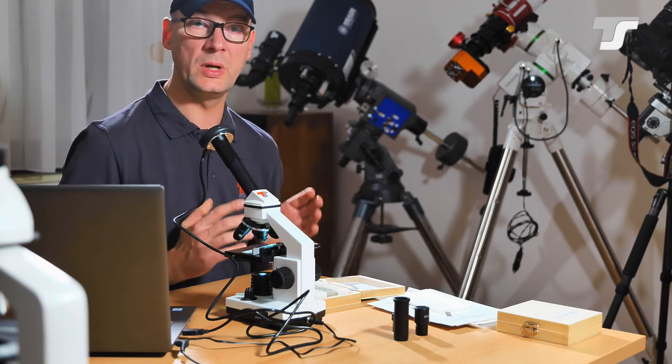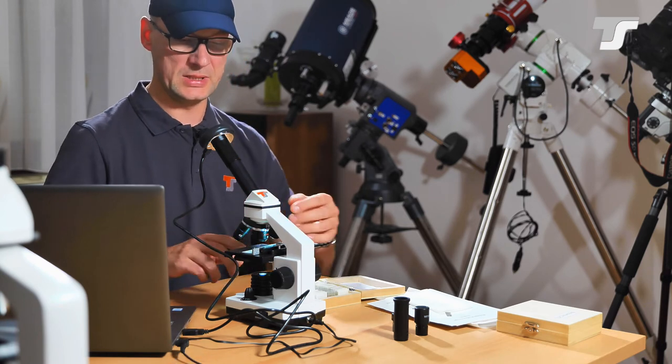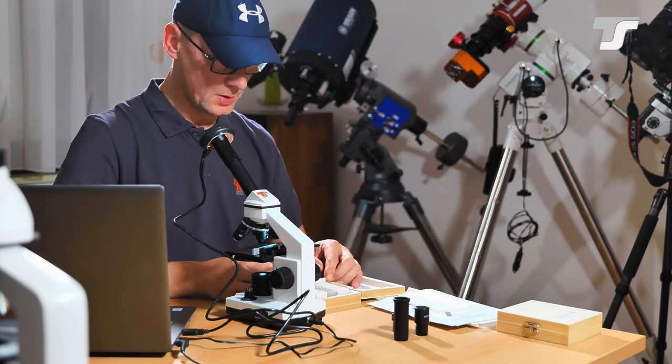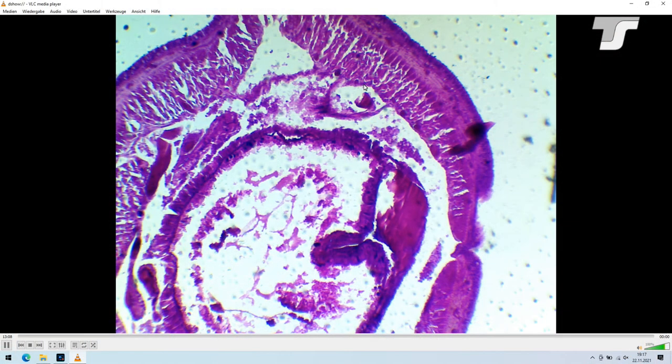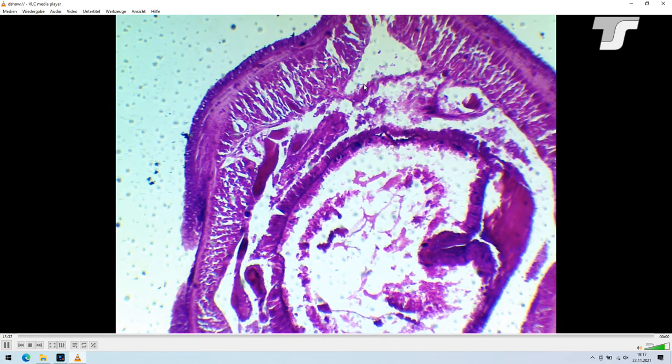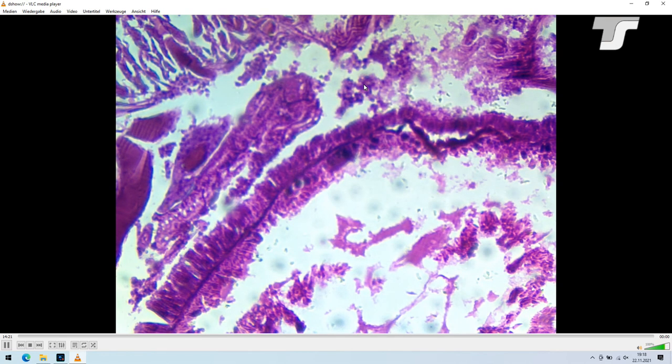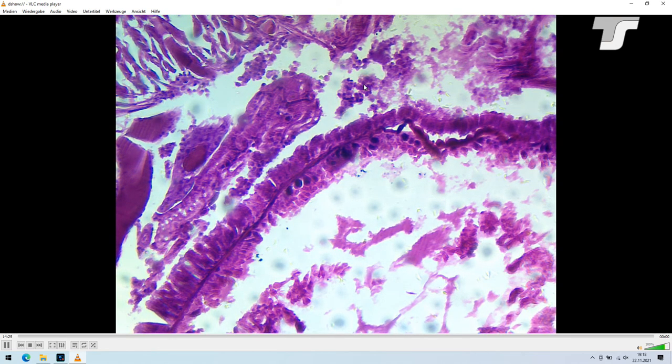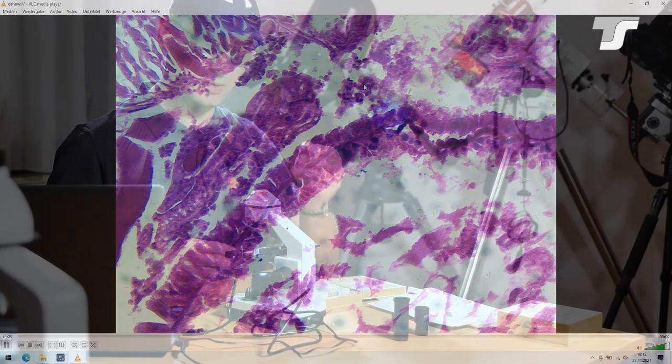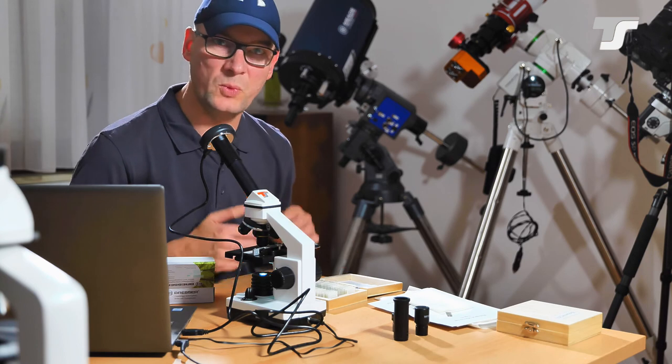And I think this is also a real cool gift for younger people, for students, for kids to get their first steps into biology for example. Okay let's grab another one. Wow that's a great example. Look at this color. Really good prepared. So now basically now it's up to you to check out what are these features in an earthworm. And again we switch to a bit higher magnification. And this is difficult to get it in focus. This is more easy when you look through the microscope because then you have no lag obviously. And this is much more easy to focus.